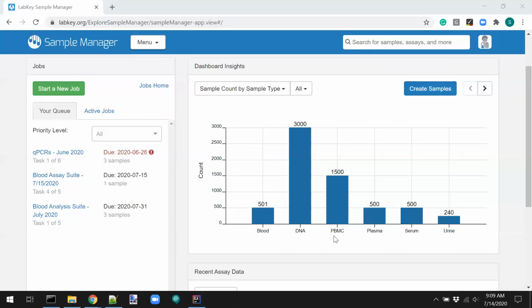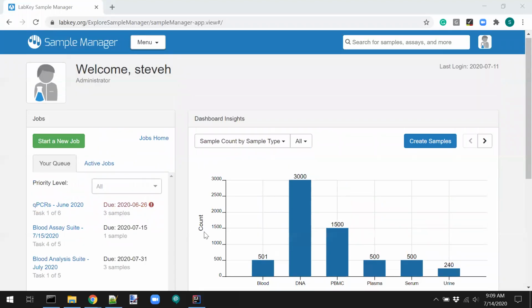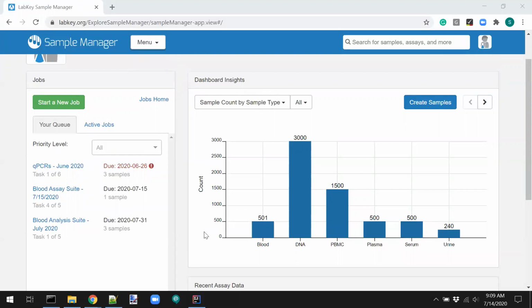So I'm going to drill into this panel here, and it'll unfold into more and more detail about the stories, the narratives around these samples and all the things that we've been doing to them in our lab. Again, this is a fake lab, it's all fake data, I invented it. So first, let's drill in a little bit more. Notice here I've got 6 sample types.